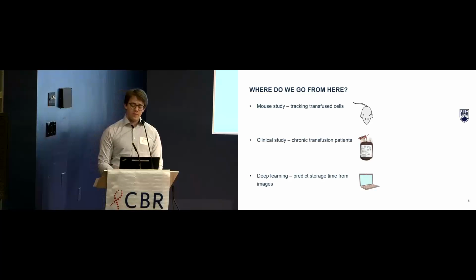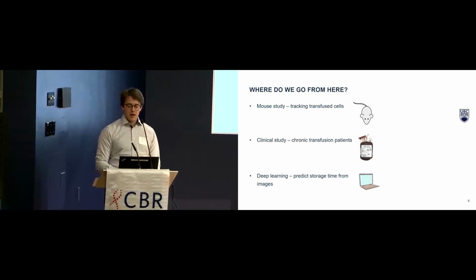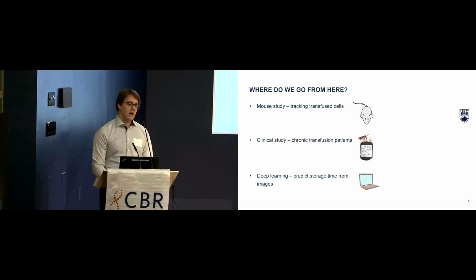Finally, the deep learning deformability prediction method will be applied to donors while their blood is stored. We aim to evaluate how well the computer model can detect storage-related morphological changes. If the deep learning model can be made more robust, it'll greatly expand the access of red blood cell deformability evaluation to any lab or clinic with an adequate microscope.